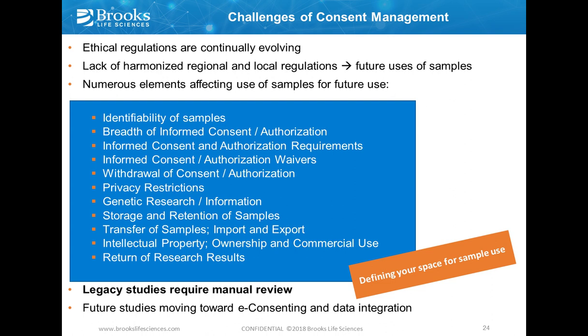Privacy restrictions I already touched on, genetic research information. We need to keep track of this. Are we allowed to do whole genome sequencing? Do we want to do whole genome sequencing? Do we ask the patient for that? Did he agree to whole genome sequencing? Then storage and retention of samples. How long? When do we have to discard? For what can we use it?